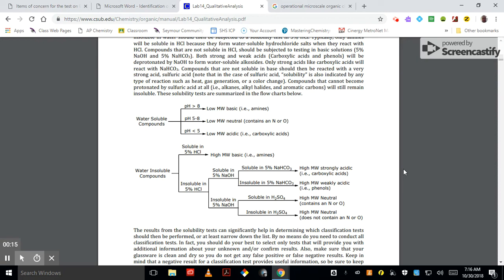What we're going to do is use the IR machine to get a spectrum, and you're going to use all of your skills that you applied in your homework problems to identify functional groups. And then you're going to run a series of chemical tests on your compound and use your microscale boiling point to look at a list of compounds and determine which compound you have based upon chemical tests, your IR spectrum, and your micro boiling point. So you get to apply a bunch of skills on this experiment.